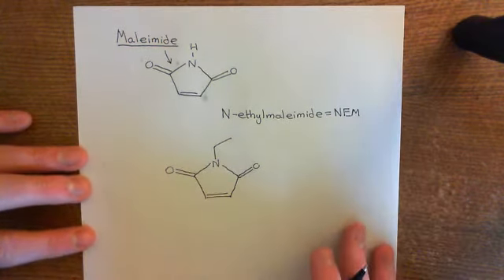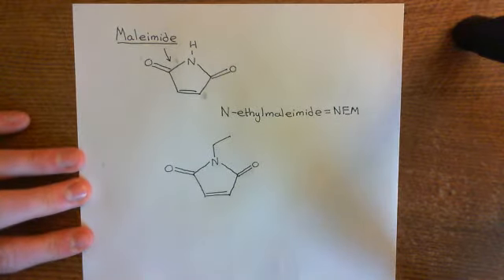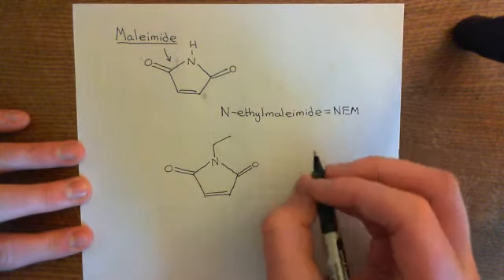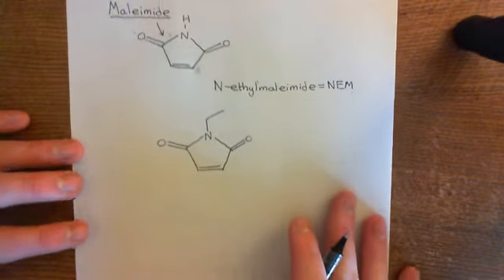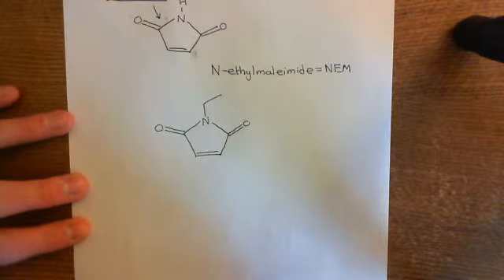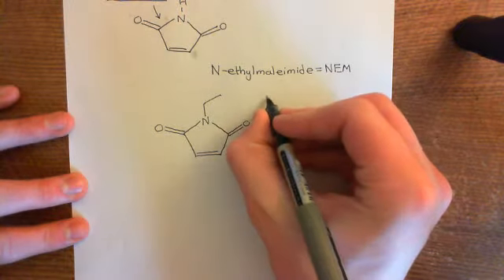Okay, now we're going to mix this substance into our protein sample. So it's going to be mixed in with protein A, protein B, and protein C in our example, of course. But of course, when you're really doing this, you'll have huge, great protein samples which will contain far more than 3 proteins. But to get the concept across, we only need 3 proteins. Okay, so what's going to happen is this N-ethylmaleimide is then going to bind to any free cysteine residues that are within the protein. So let me show you how this is going to happen.